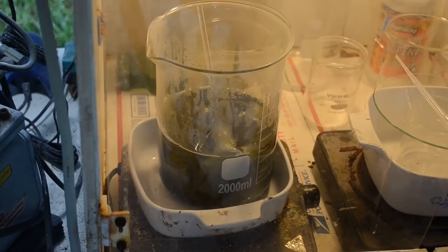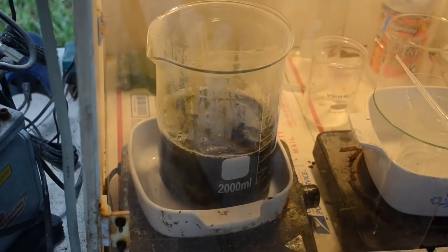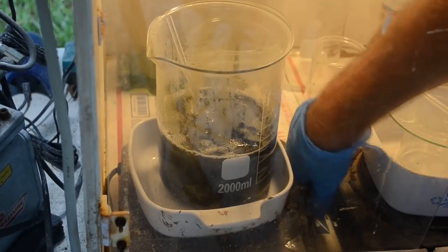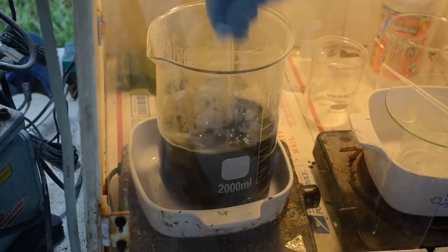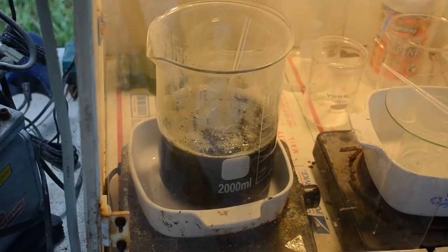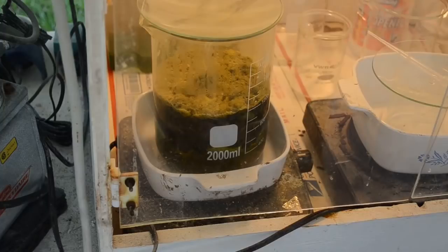That's probably a little over 10 right there. We'll start with that. I can add more to get the hot plate turned on. Things heating up. And we'll see how this goes. Give it a few minutes and I'll give you a look at it.